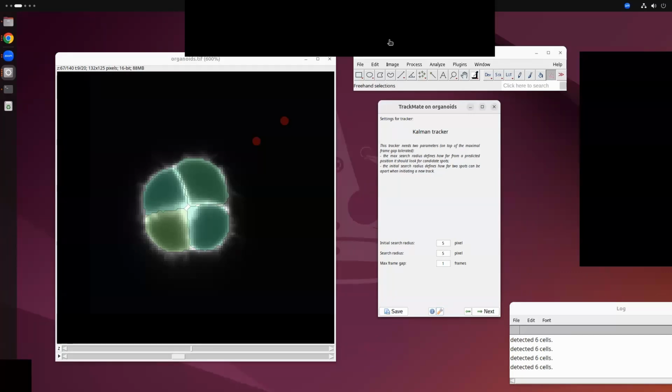If you know a little bit of 3D graphics, a mesh is a standard data format to describe a 3D shape. The 3D view you see is simply rendering that 3D mesh through a particular view, distance and angle. So that's sort of a snapshot of things.